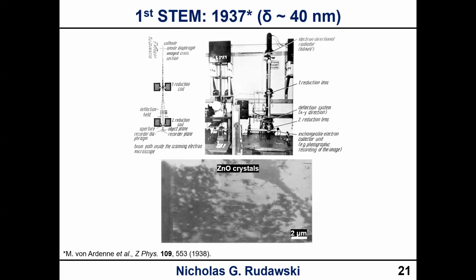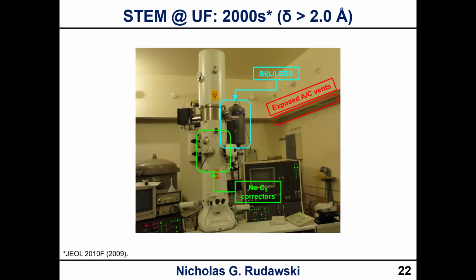So of course, very important. And then if we look at actually what was happening at my institution, kind of around the time when I was a postdoc actually, our STEM resolution was not great here. This was capable of getting 2 angstrom or less STEM resolution, but the images we were getting out of this were not very good.